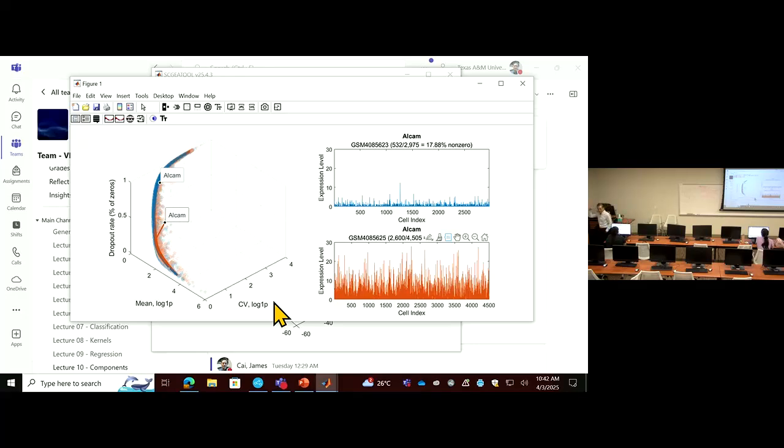So this gene list is a result of the DV analysis, differential variability. You can have this, just do this. Just a table, yes.